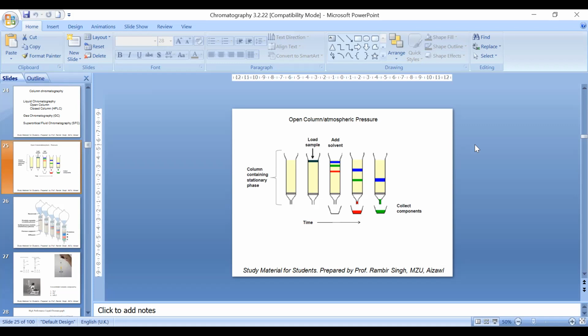Now what has changed? They have the same retention sites. Now the number of retention sites has increased 10 times, to 10,000. But on one molecule, the retention sites will be the same. Now what has changed? The number of retention sites has increased to 10,000. But what hasn't changed?